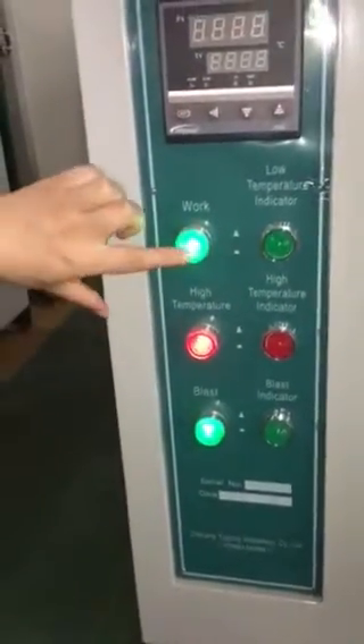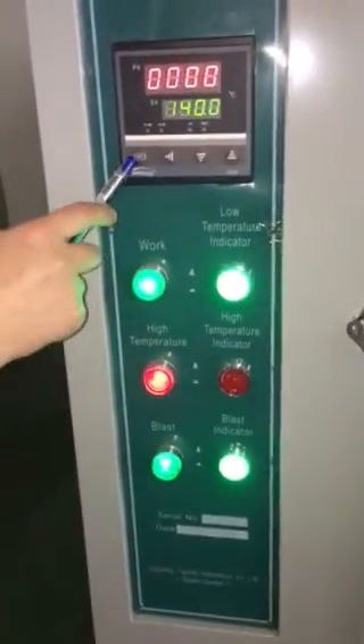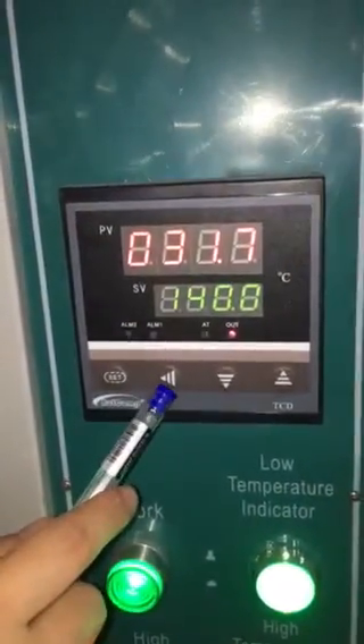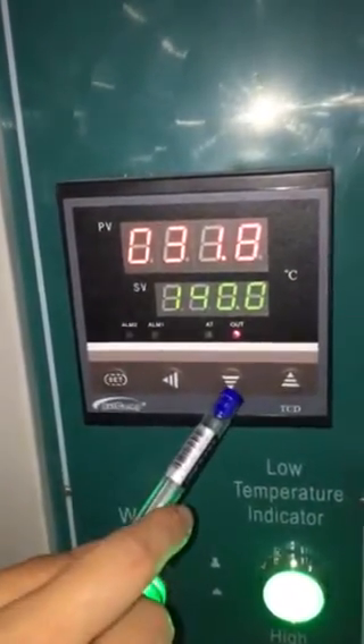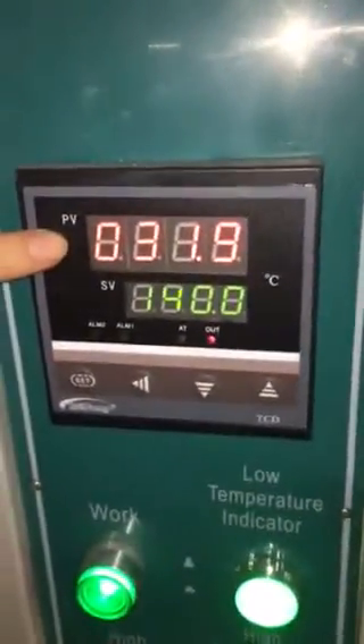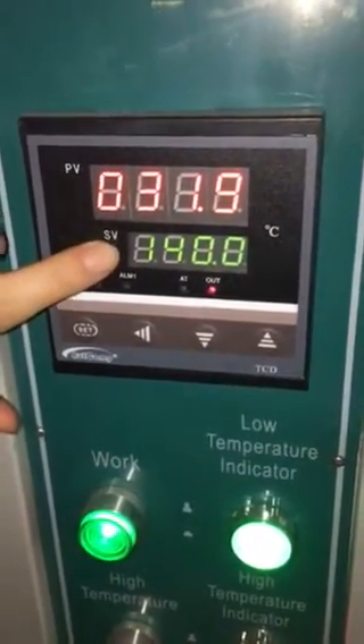If you need work, press this. This is the setting. This can choose the number. This is down. This is up. This is for current temperature. This line is for setting temperature.